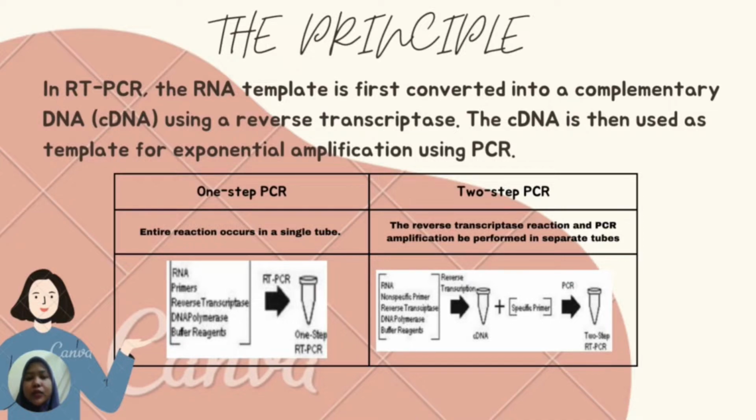Place PCR tubes in the thermocycler to begin cycling. The first cycle is reverse transcription to synthesize the cDNA. The second cycle is initial denaturation. During this cycle, reverse transcriptase is inactivated. The next 40 to 50 cycles are the amplification program, which consists of three steps, which are denaturation, annealing, and elongation. The RT-PCR products can then be analyzed with gel electrophoresis.